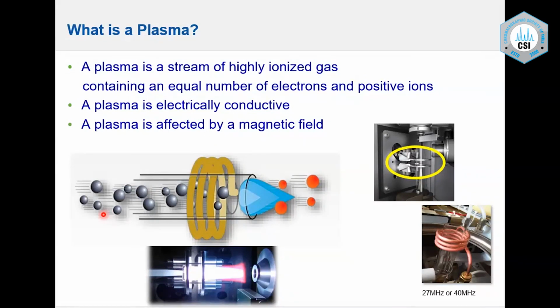Yeah, so here we apply RF power. We supply radio frequency to this, and when ignition happens, we give a spark here. Due to the spark and this electromagnetic field, the elements get ionized and have movement and multiplication of ions and atoms, and you get a stabilized plasma like this one.